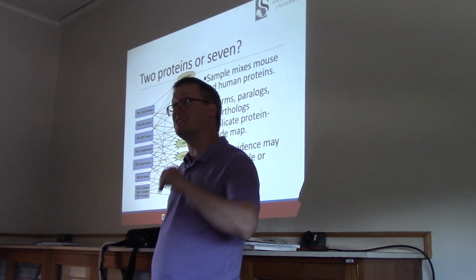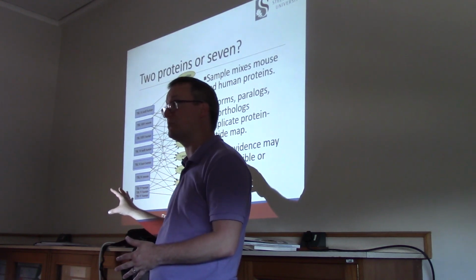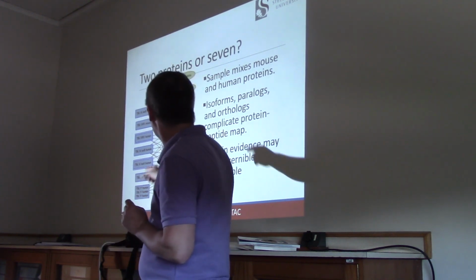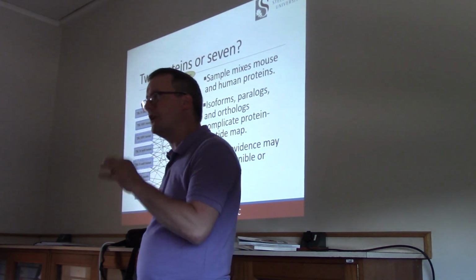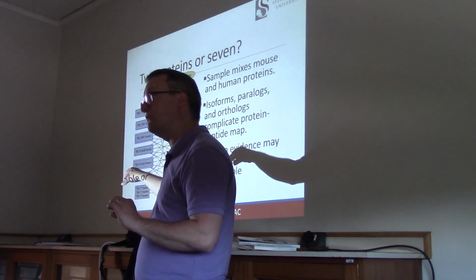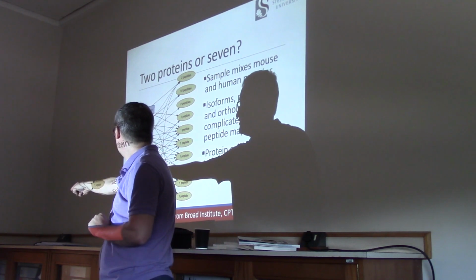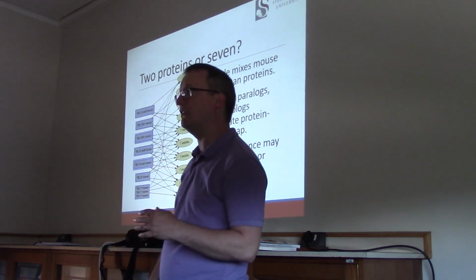So you can see that this cuts down the protein numbers quite a lot in these multi-species databases in particular. But I'm going to introduce another kind of complex frustration about this. In this case, did we identify no mouse proteins at all in this particular graph? Because you can see that the explanation we're reaching includes just these two human proteins, and this possible mouse protein fell away. That potential mouse protein fell away.